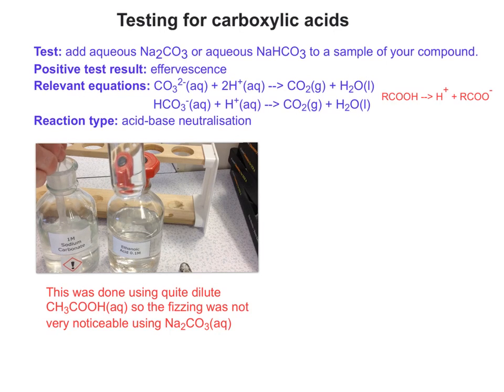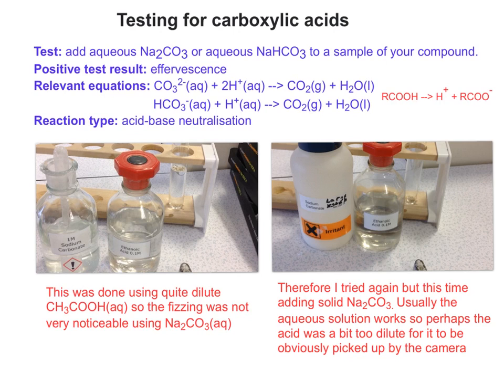But I felt that wasn't very indicative of what we're trying to demonstrate here, so I actually did a second clip where I added some solid sodium carbonate instead. Now in the top of the screen you'll see it says add aqueous Na2CO3 or aqueous sodium hydrogen carbonate. You should be able to make it work with aqueous solution. So I gave it another go to try and make it work this time using solid sodium carbonate.